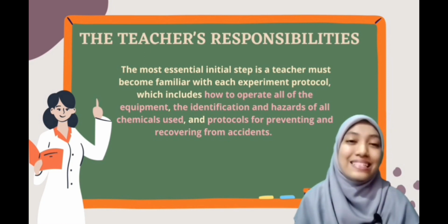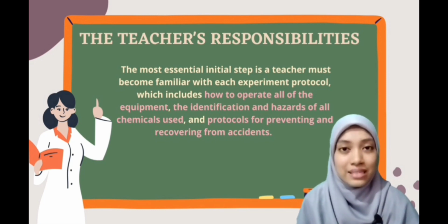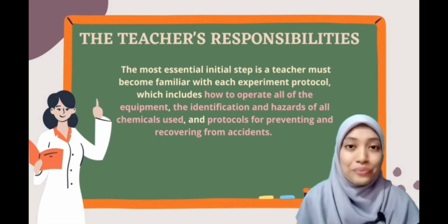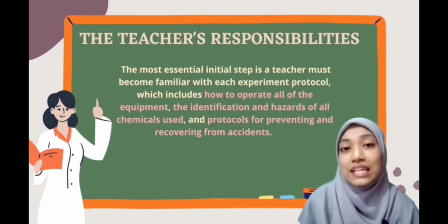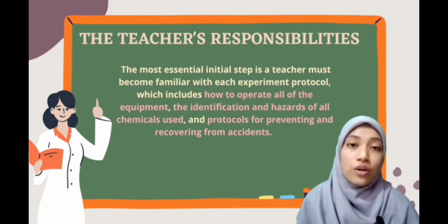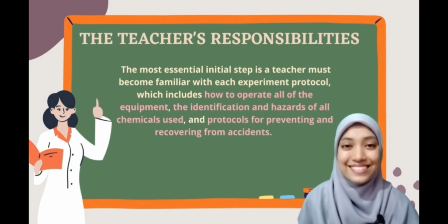The most essential initial step is that a teacher must become familiar with each experiment protocol, which includes how to operate all the equipment, the identification and hazards of all chemicals used, and protocols for preventing and recovering from accidents.